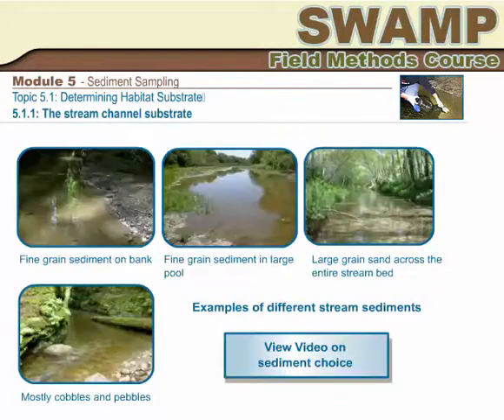The purpose of sediment sampling is to find the area where pollution occurs. Many of the chemical constituents of concern are absorbed onto fine particles. One of the major objectives in selecting a sample site, and in actually collecting the sample while on site, is to obtain recently deposited fine sediment.